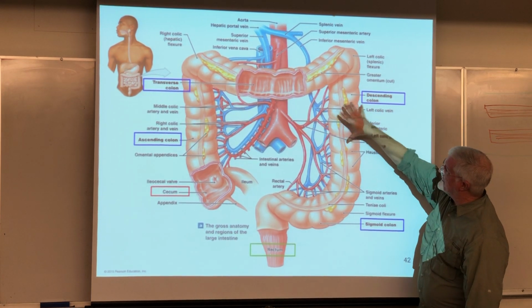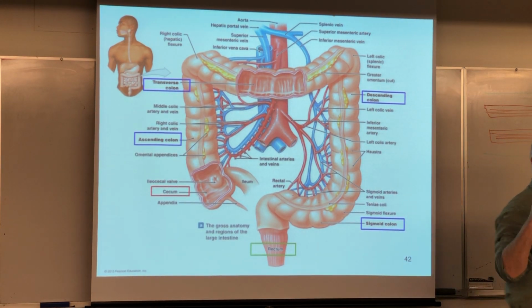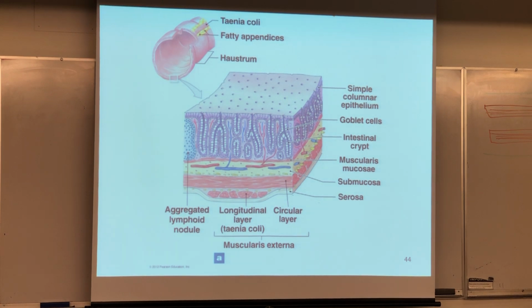So what does the stuff look like over here? Well, next chance you get, I want you to go play with a nicely fresh, wet cow patty. Yeah. That's what your poop is like about this region of your colon. Rather fibery, there's some substance to it, but it's also kind of moisture ridden. Right? But it's kind of rough. And I need to create lots of lubrication, which is why we have all these goblet cells, to provide lots of mucus.